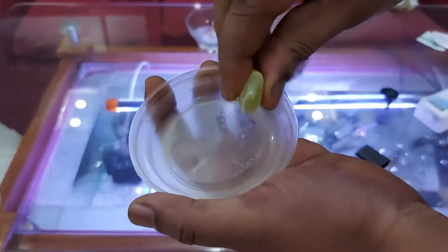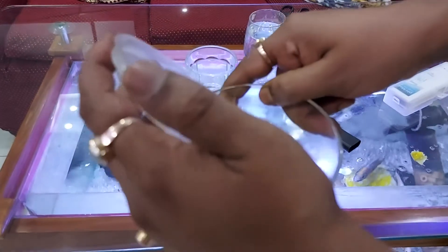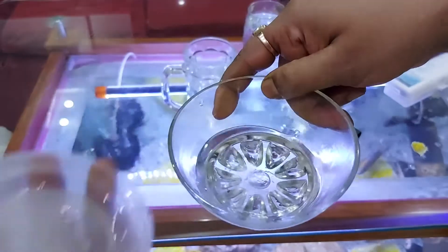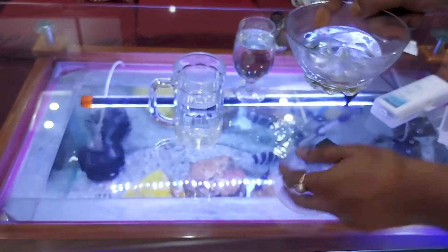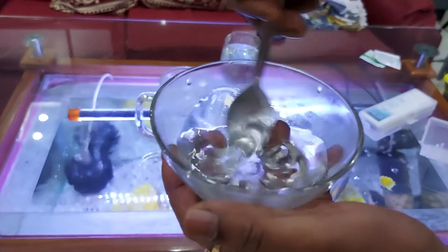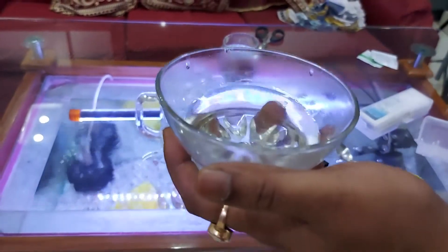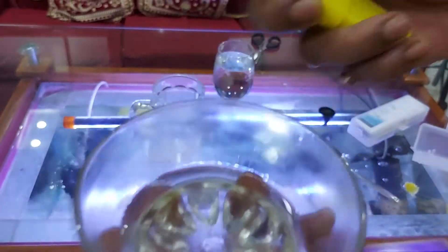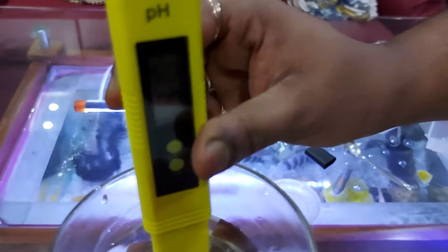It's now time to test the pH meter. Let us make a lemonade solution — we are mixing lemon into water to make a lemonade solution, and now we will test the pH of the lemonade solution. Just turn it on and dip it inside till the mark.